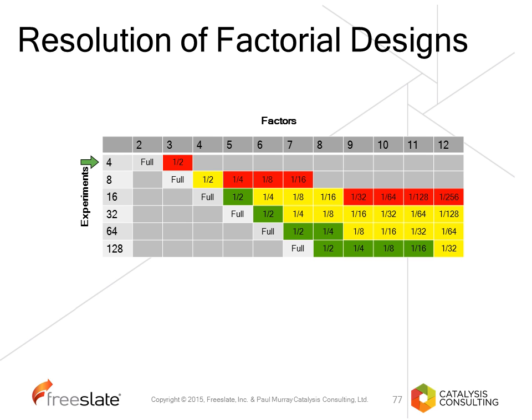What we have here then are some designs which are marked with red, yellow, and green. Ideally, you would choose to run a design in the green box. So for instance, if we look at 6 factors, we can investigate 6 factors in 32 experiments, and that's a half factorial.